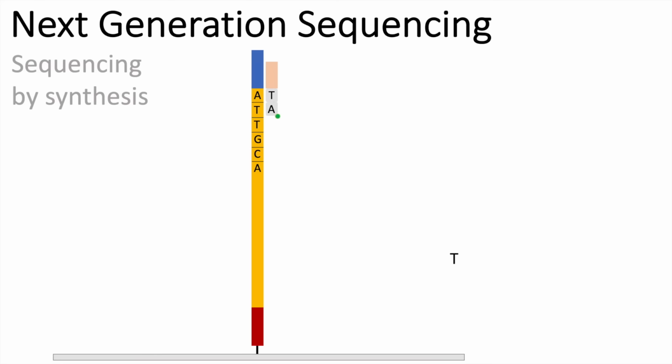Again, the fluorescently labeled A is excited and we will receive a signal again, this time an A. This whole procedure is done for all of the nucleotides, one by one, and this is how we get the sequence. For simplification purposes, we just looked at one of these copies. Now notice that due to PCR we have several copies, so many light signals are obtained simultaneously.